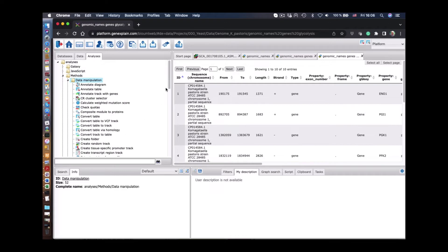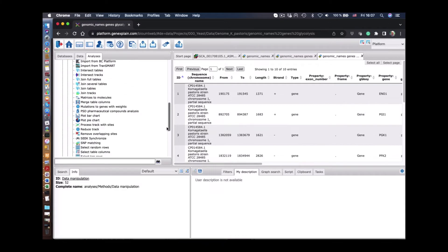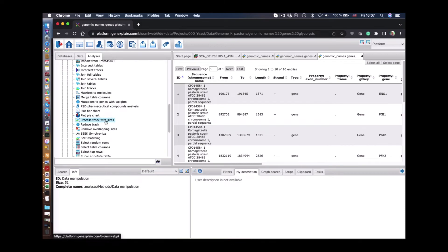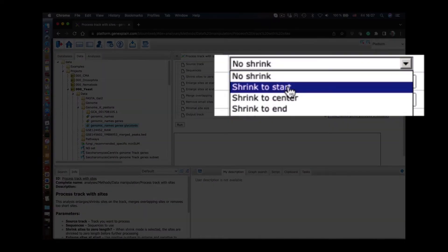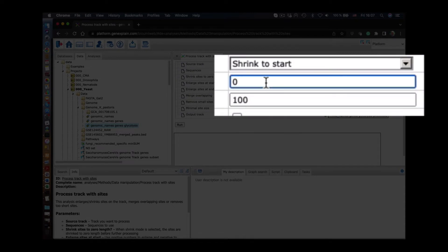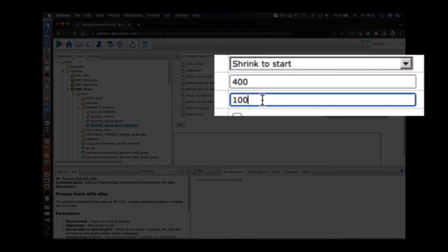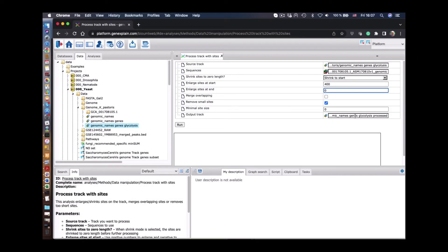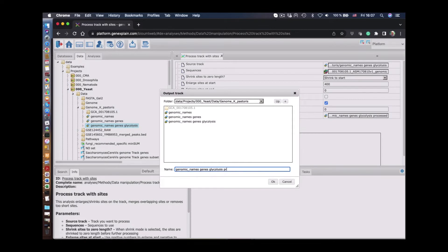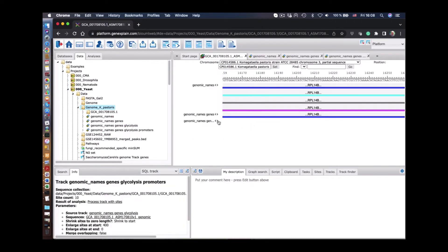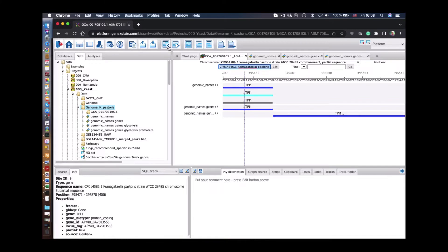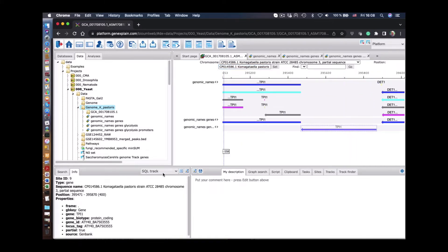Now we want to select or extract the promoters of those genes. For that we start the function called 'Process Tracks with Sites' and input the annotation file for the glycolysis genes. We define the promoter length of 400 nucleotides upstream from the start of the gene. We save this as a new annotation file called promoter annotations. Now we see this new file which contains the promoter track for these 10 glycolysis genes.